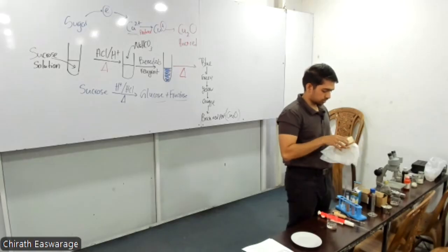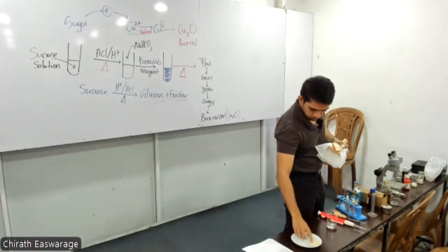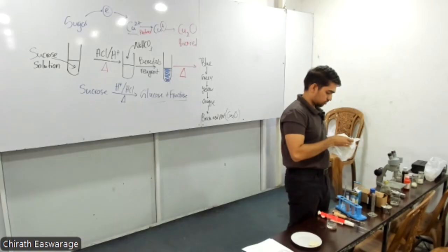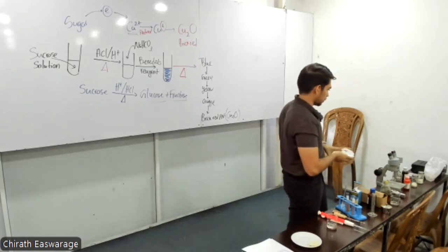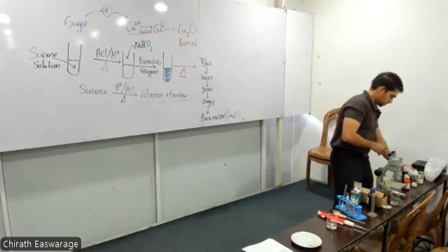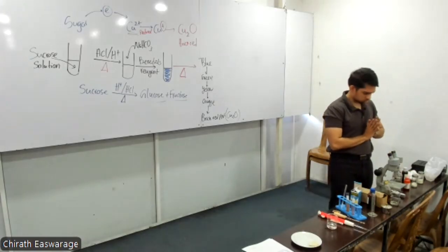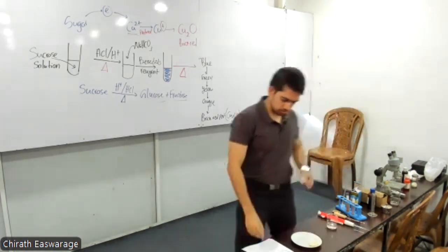White bread is best, right? So you can take some bread. So did I bring starch? Yes. Right. Read the experiment.